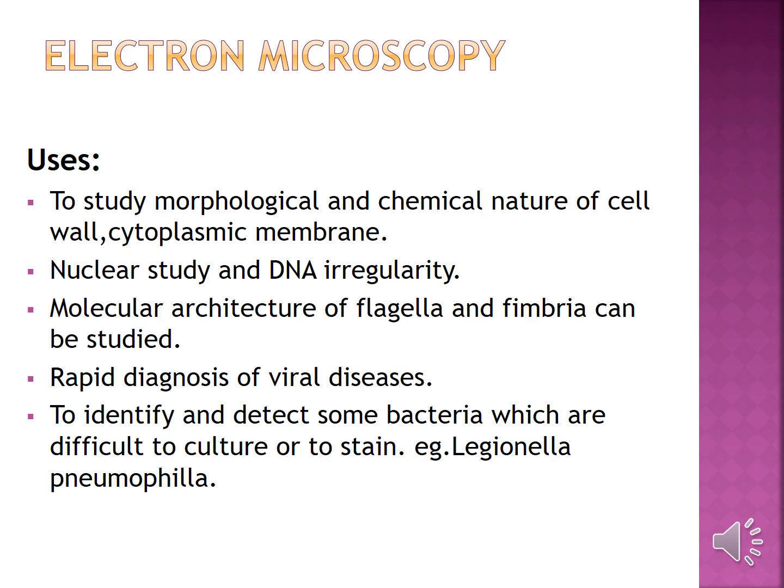Uses: to study the morphological and chemical nature of the cell, cytoplasmic membrane, and nucleus, and to study DNA integrity and irregularity. The molecular structure of flagella and fimbriae can be studied. Rapid diagnosis of viral diseases, and to identify agents and bacteria which are difficult to culture or to stain. Example: Legionella pneumophila.